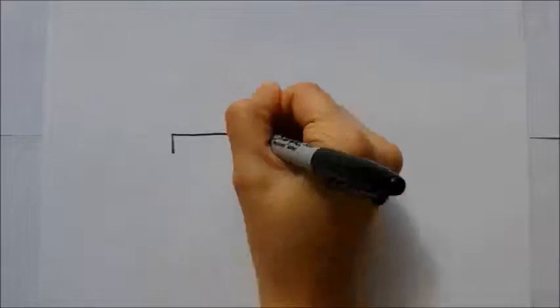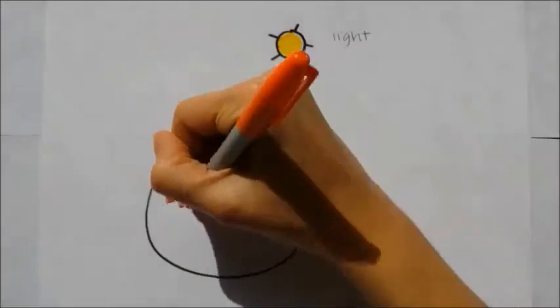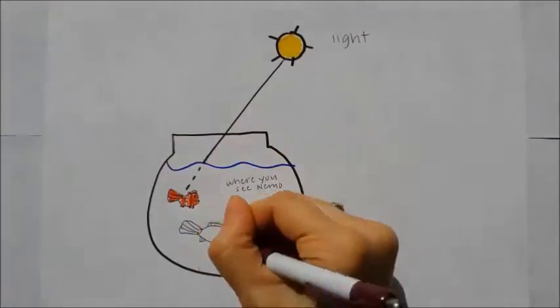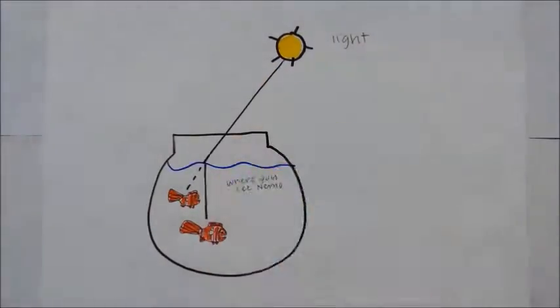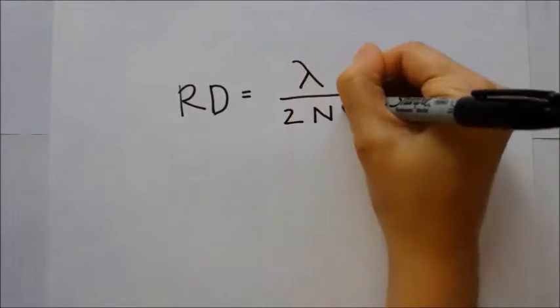The reason this does not and cannot exist is due to the diffraction limit, a fundamental concept in physics that cannot be defied. In 1873, the German physicist Ernst Abbe was credited for discovering the resolution limit of the microscope. He found that microscopes, telescopes, and other optical imaging instruments are fundamentally limited by the diffraction of light. This is currently defined by the Abbe limit.